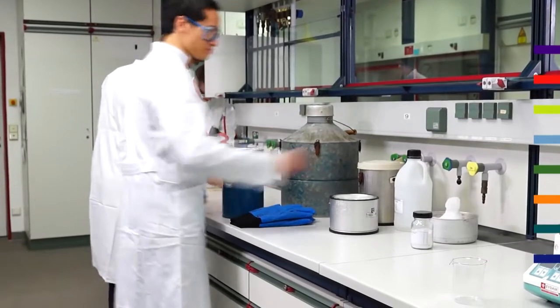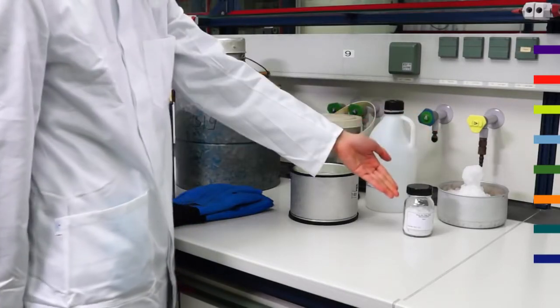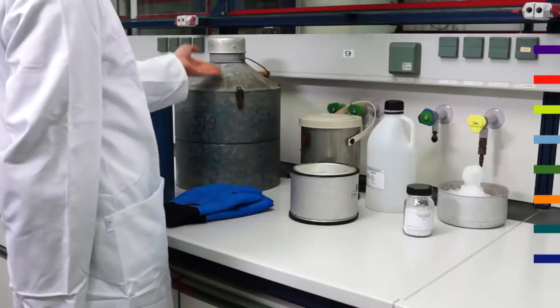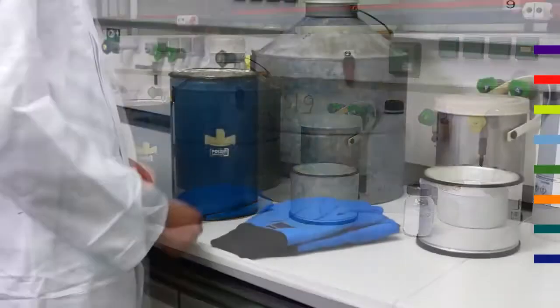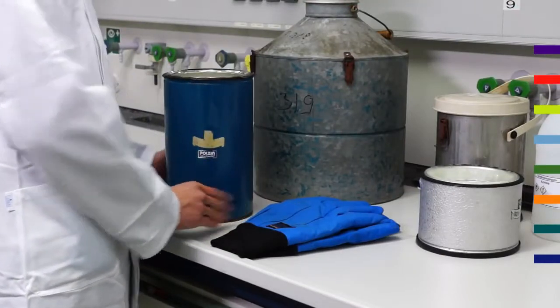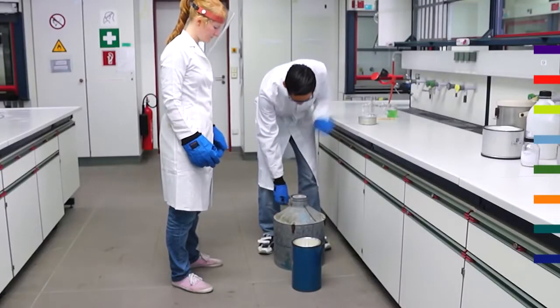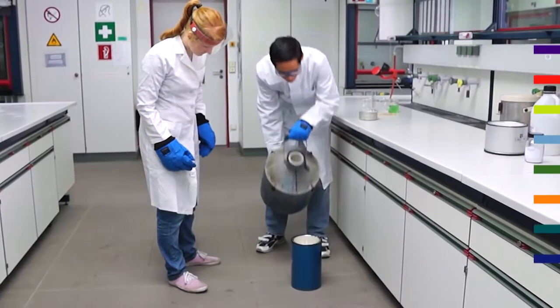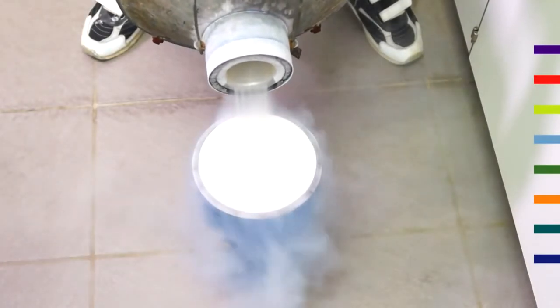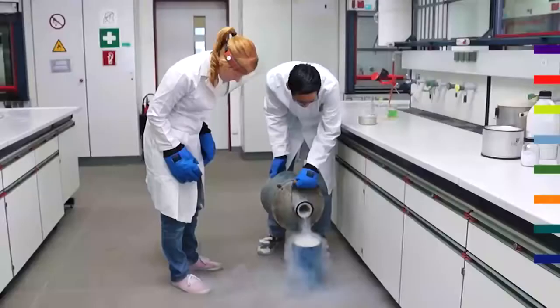The cooling of a reaction may be performed with various techniques, with ice, a mixture of ice and rock salt, or with cooling mixtures consisting of dry ice or liquid nitrogen with various solvents. Here, you must take precautions that you choose the correct vessel and pay attention to using safety equipment. Generally, dewars are suitable. Liquid nitrogen and liquid helium belong to the ultra-low temperature coolants. In the liquid state, they have temperatures of minus 196 degrees centigrade to minus 269 degrees centigrade.